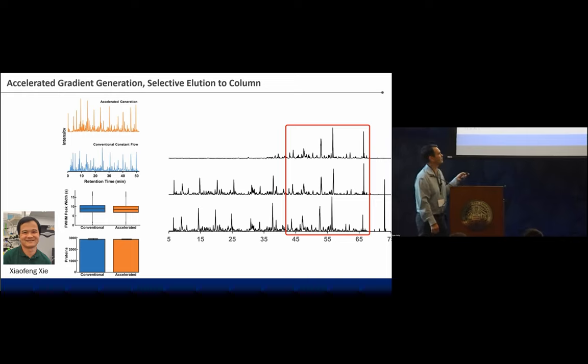If we zip back here, so 30,000 PSMs or 28,000 PSMs, but they're redundant, right? Some of those are redundant, so that's why we only get about 10,000 peptides with MS2 alone, and then with match between runs, we get 20,000 peptides per cell. It's that redundancy that limits our coverage. We don't identify 28,000 peptides, but what it does help with is reducing missing values because we're identifying the same peptide multiple times.